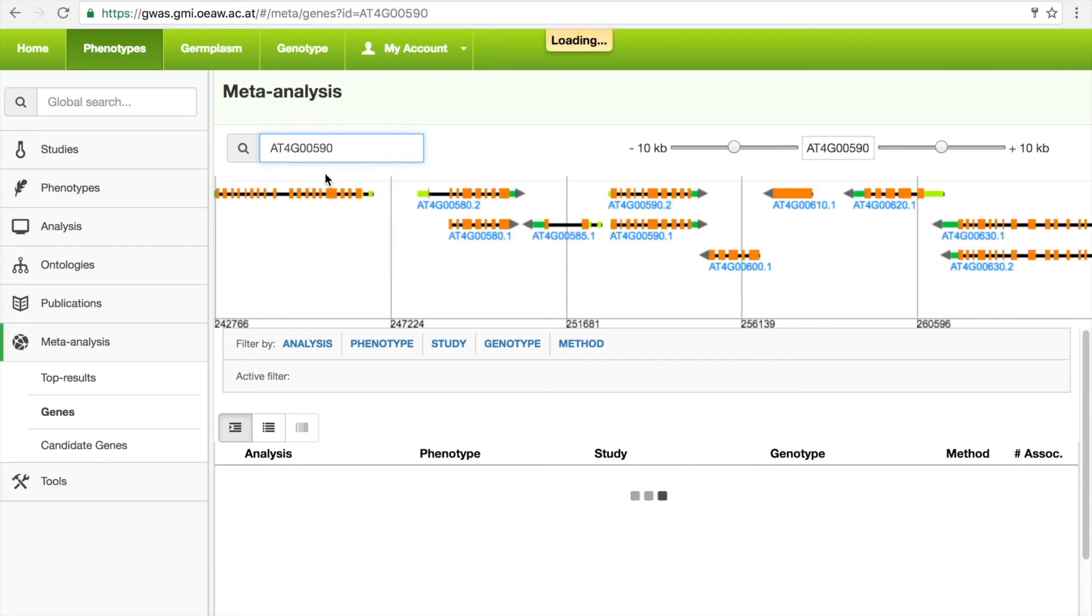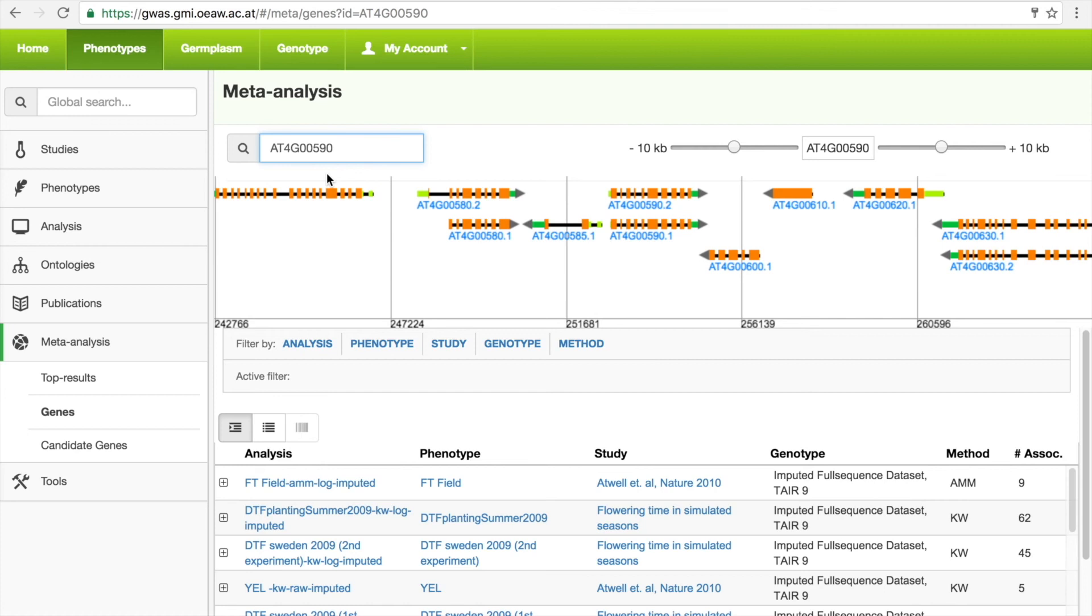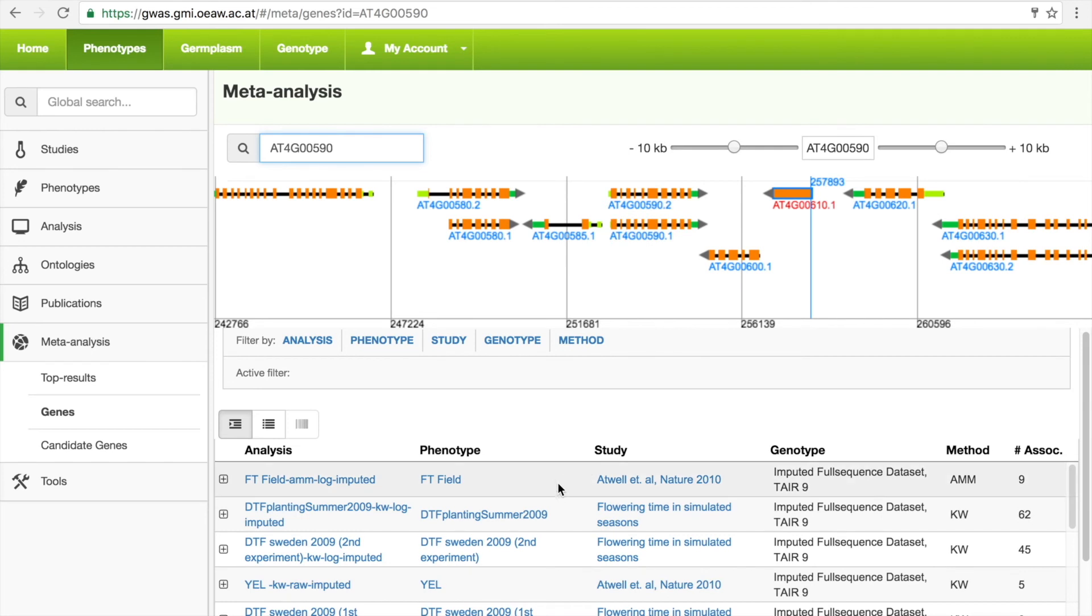This displays a gene annotation track with the gene centered inside a 10KB region up and downstream. The GWAS portal fetches all of the associations in the database found within this region. Hovering over a study will display a blue bar on the gene annotation track that indicates the position of the most significant SNP from the study.